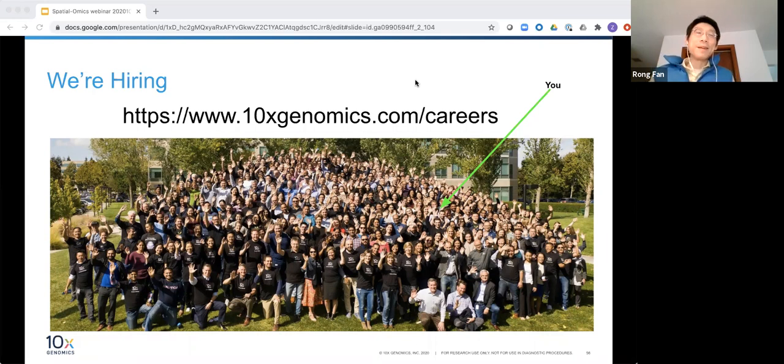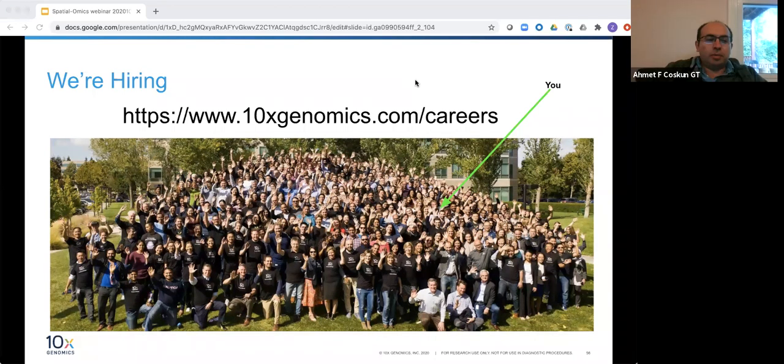But for now, for the banked FFPE tissues, I think the variability is huge. But if we could do something like permeabilization optimization for those samples, that's probably the short-term solution. Well, we talk about precision medicine. How about precision reagents, right? I think that would be cool.